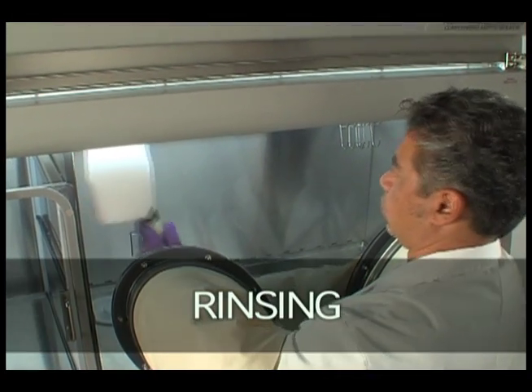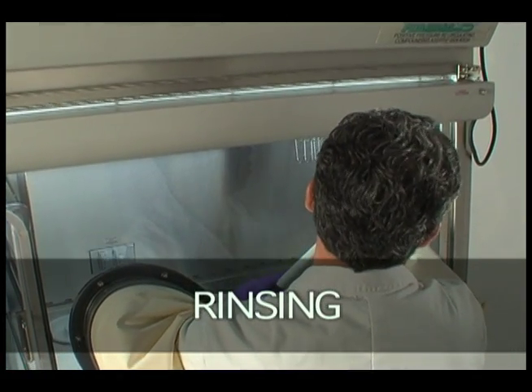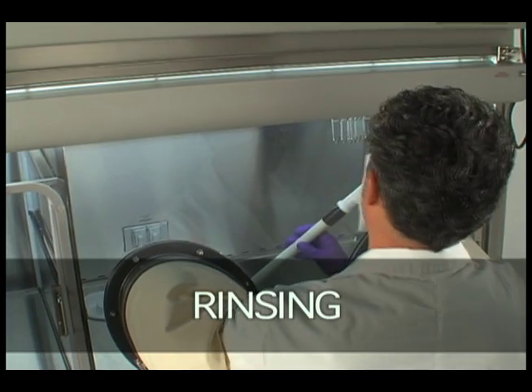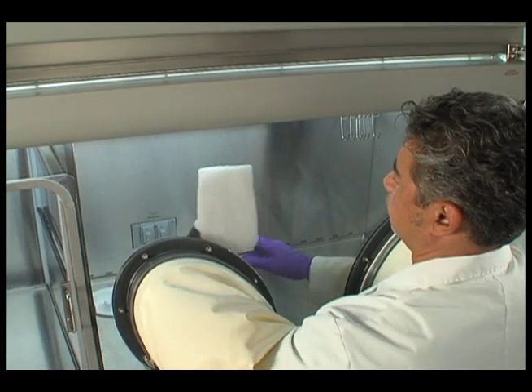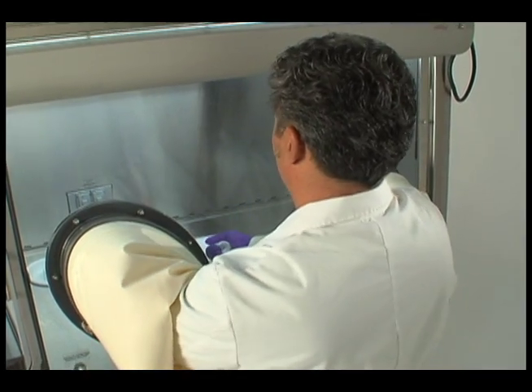Rinsing: Pre-wetted wipers, deionized water, or 70% IPA should be used to remove disinfecting agent residues from surfaces. It is important to rinse the surface after disinfection to prevent corrosion of the stainless steel surfaces.